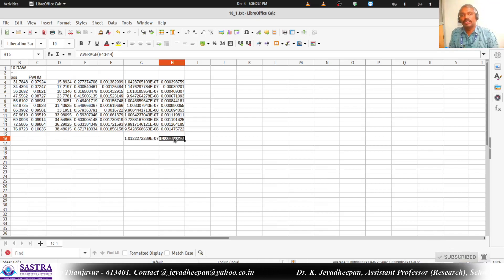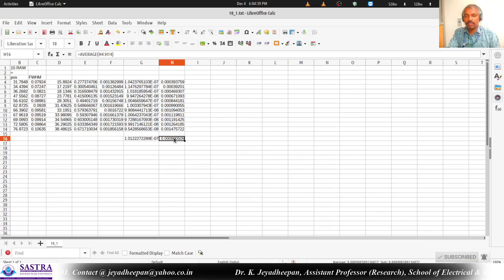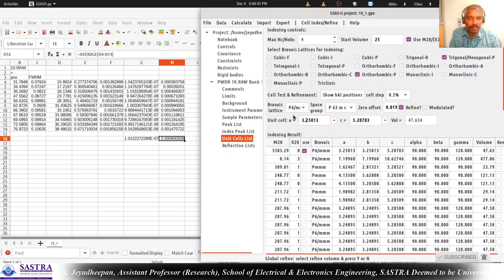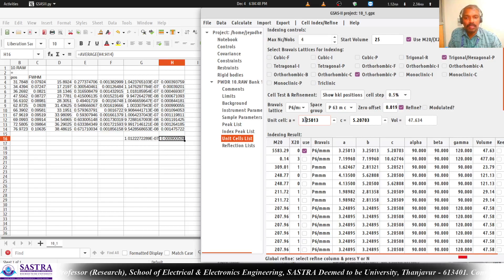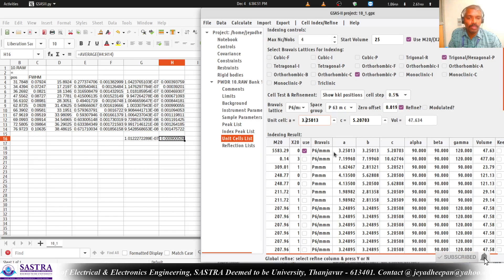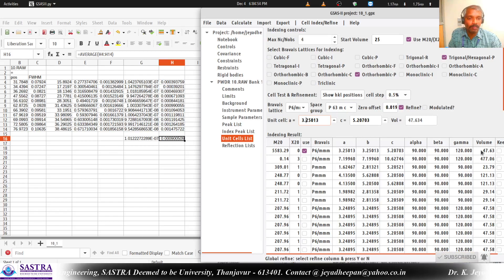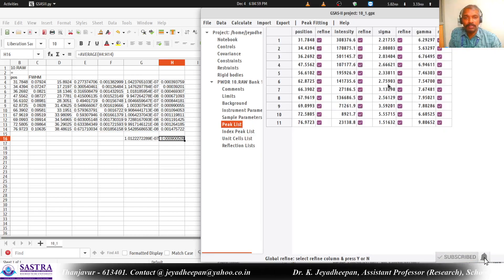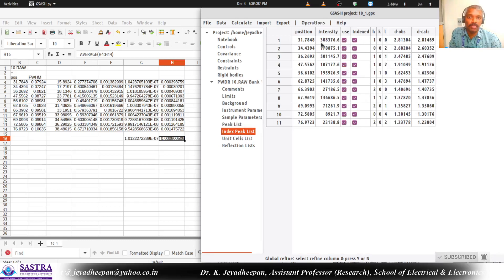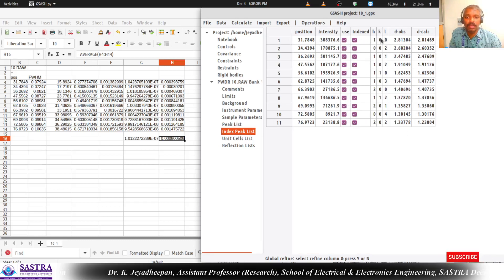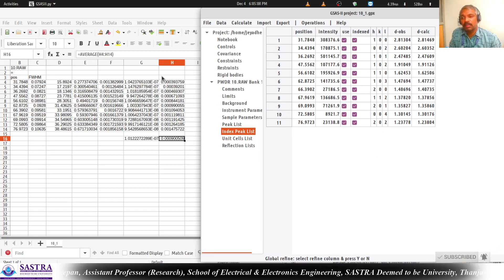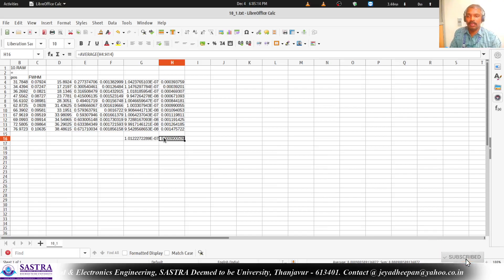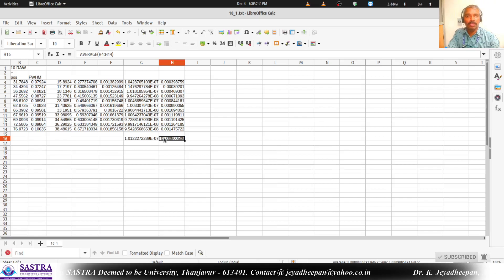So here in this semi-quantitative phase analysis, what are the things we have done? We extracted the unit cell parameters A, B, C, alpha, beta, gamma and volume. We have the indexed peak list with HKL values for all the peaks. And from that particular peak list, we determined the crystallite size and strain values. With this, we will be concluding this video. Thank you.